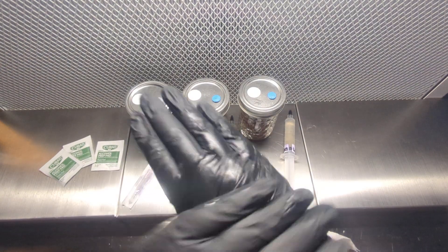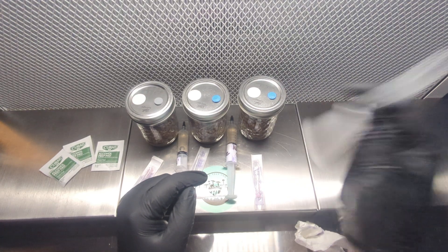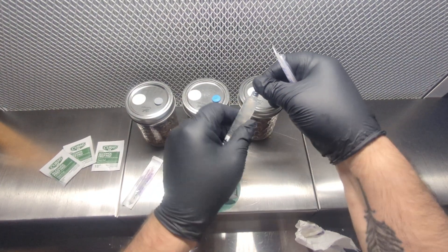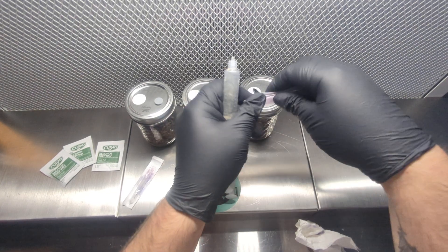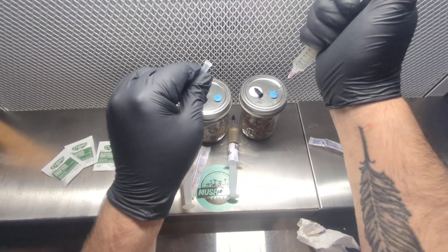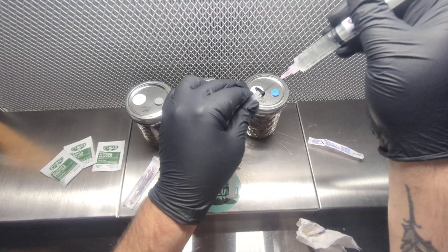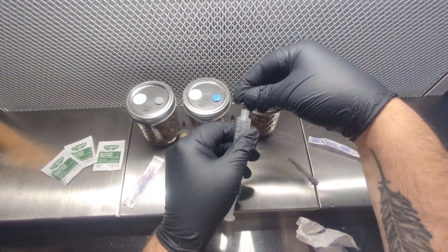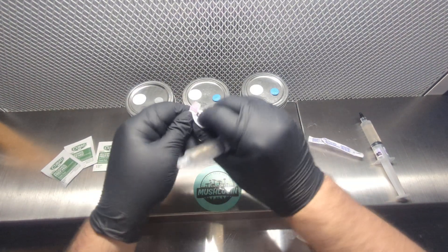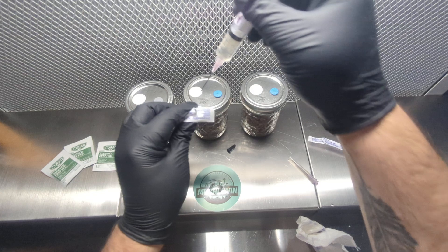I'm going to give my hands one more nice little spray to make sure nothing's on my gloves. I'm going to get the liquid culture and shake it up real good — sometimes it'll clump really hard so you've got to get into it. I'm going to take this, take the cap off, and work quick and smooth. I'm putting approximately two CCs into the H1, putting it right in the middle, pushing it down, not moving around too much — just straight in. Pull it out, cap it, and put the cap back on for later use. I'll do that with all three.